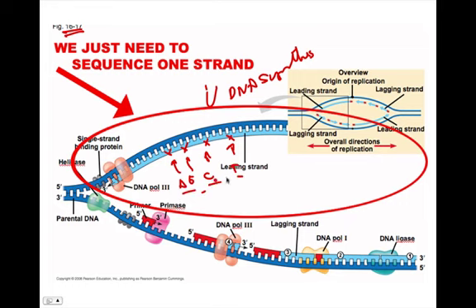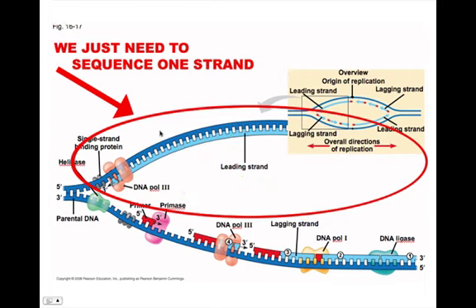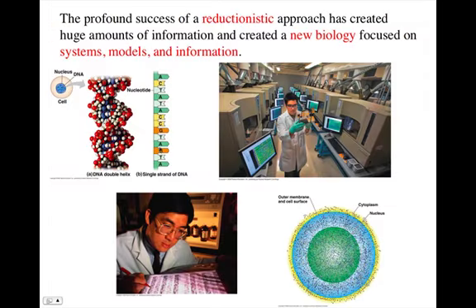Having a spectrophotometer read the colors as they're being added to the DNA will allow us to read the underlying sequence. So the power of DNA sequencing comes from what we just learned about in chapter 16, replicating DNA and doing that in a test tube. That's being done. Here's one DNA sequencer. Inside that sequencer, there are hundreds of little tiny test tubes, and each test tube holds a DNA sequencing reaction.